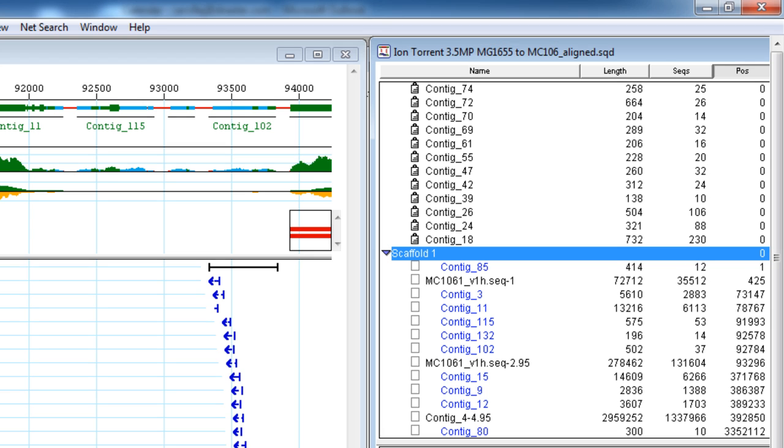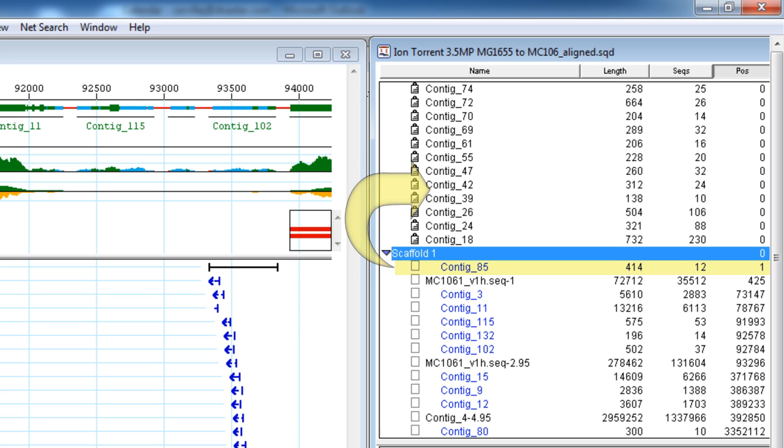To continue merging contigs, it often helps to move contigs with low coverage out of the scaffold and into the unlocated contigs group. These lower-coverage contigs can block end-to-end joining of larger contigs, so removing them can allow the remaining contigs to merge.